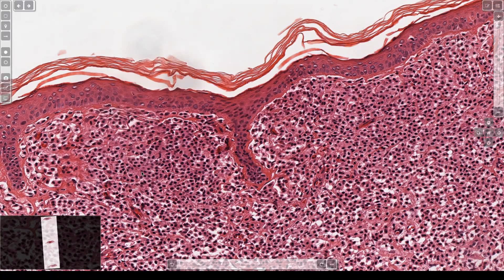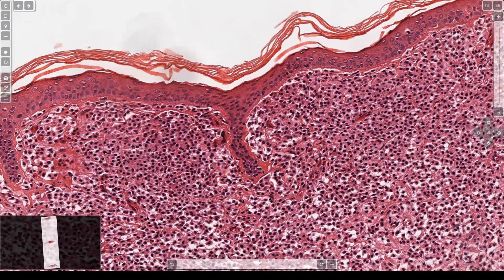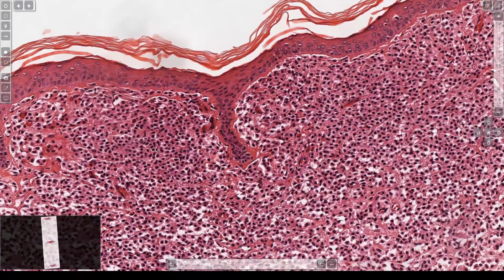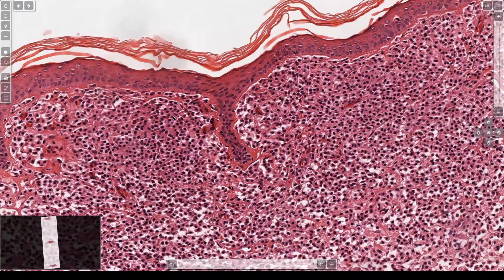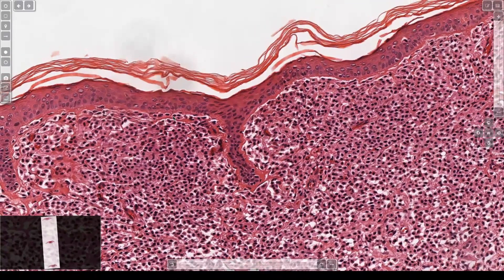Additional stains for mast cells include Giemsa stain, toluidine blue — which is more or less a variation of those — and mast cell tryptase will also stain these cells.